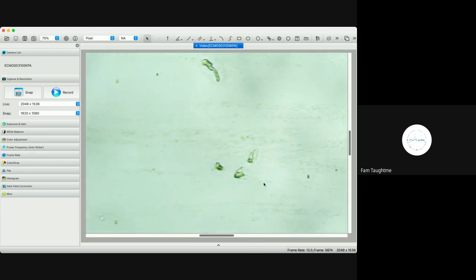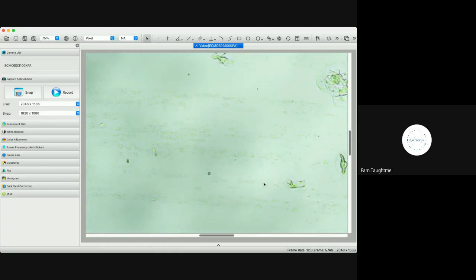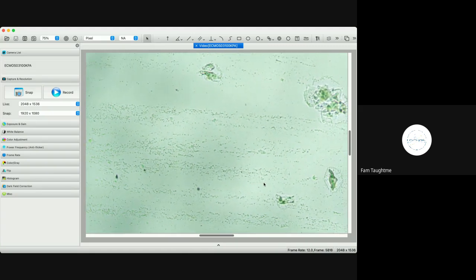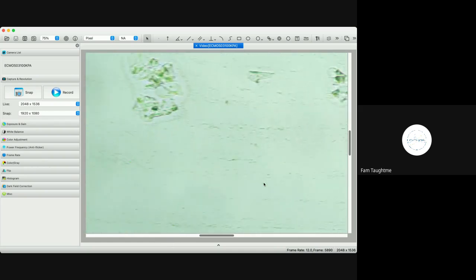Kind of goes in this long line. Yeah, you can see it here. So it doesn't look like the perfect lines, but you can see the general shape here is that it's following a line. And then usually what I would see is it goes all the way across, for a long way.